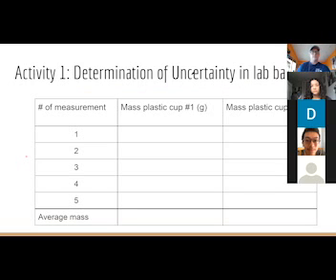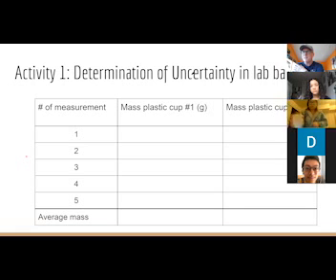I have a question. Yep, go ahead. How do you put the batteries in? Yep, got to have batteries in there. I think sometimes the batteries, in mine, were already in there, but they were wrapped in plastic. So I needed to take the plastic off.